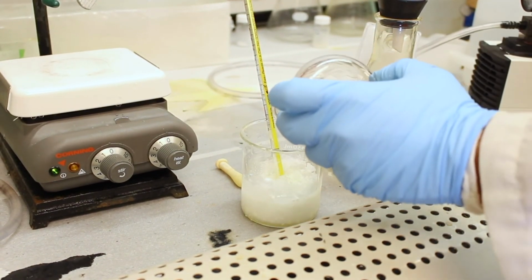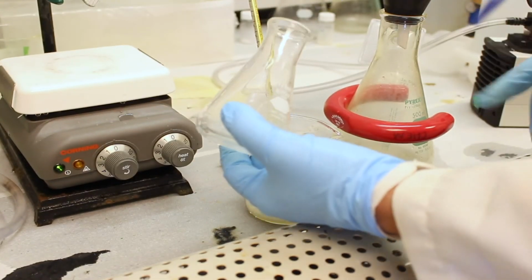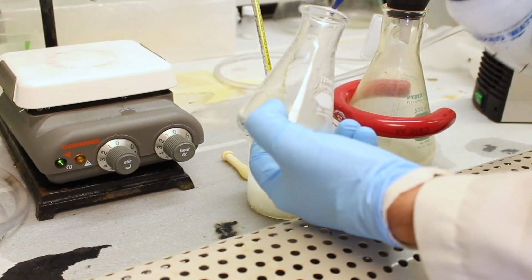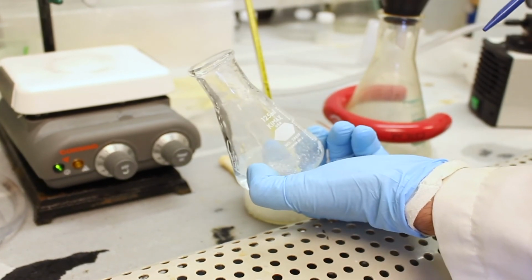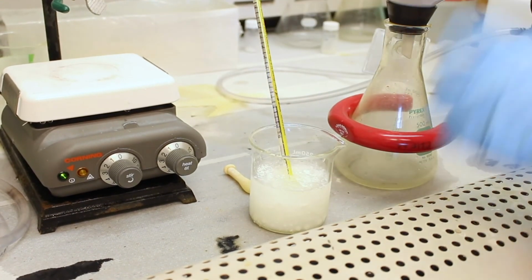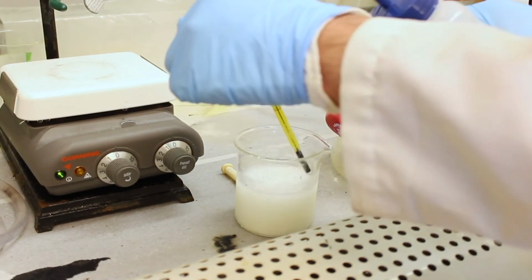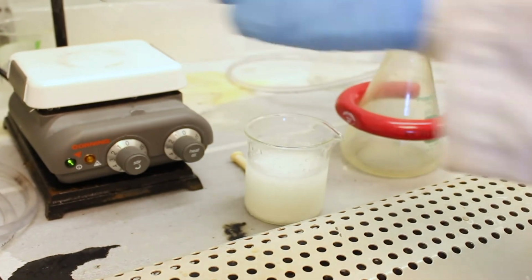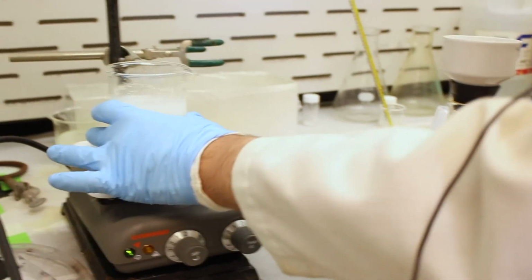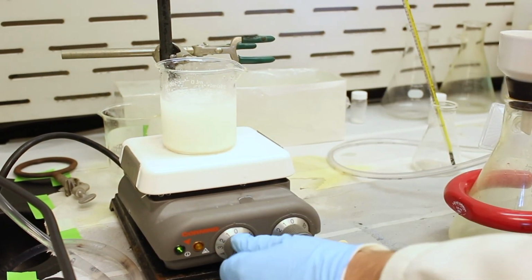And then we'll use a little bit of water to rinse out the Erlenmeyer flask. And there you can see some of the product precipitating as a white solid. So that's what we're after. As you can see, it's also fuming because of the nitric acid. Okay, so that should be sufficient. Now we're just going to stir it up. Now I think we'll let this stir until all the ice is melted. And once all the ice is melted, we'll vacuum filter it and collect the product.